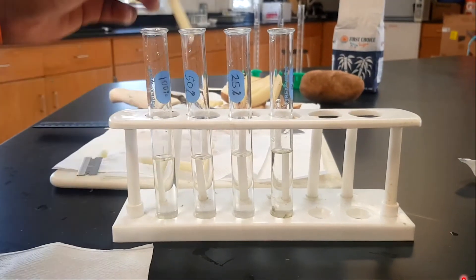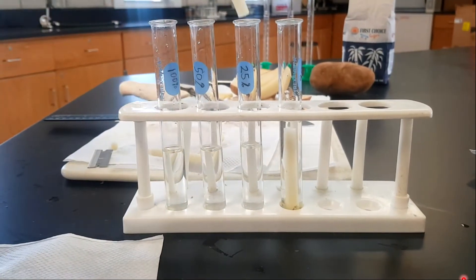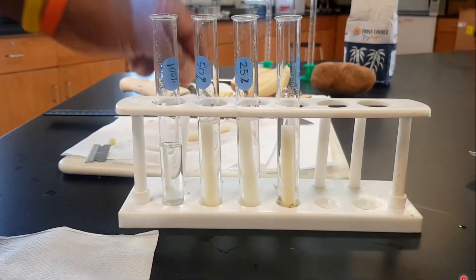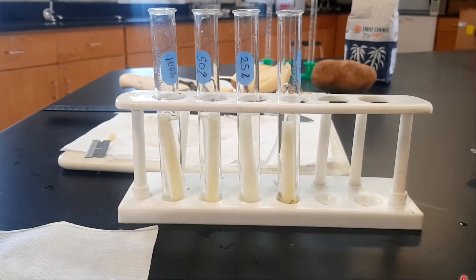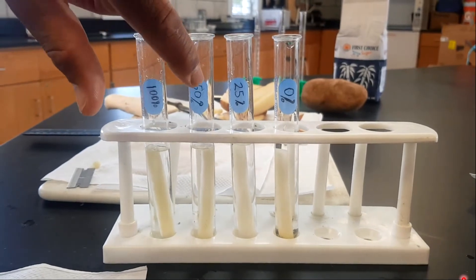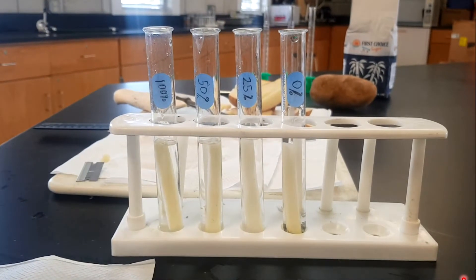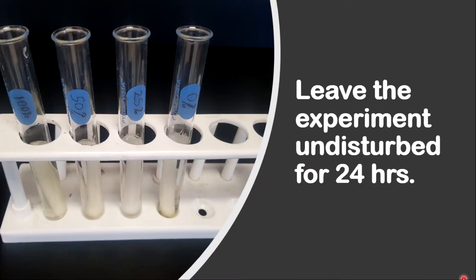Now move on to the next step — insert each strip into a test tube. Before inserting, record and note what you can observe, and make sure you note the texture of the potato before putting them in the test tube. Once you've inserted all the strips, leave the experiment undisturbed for 24 hours.